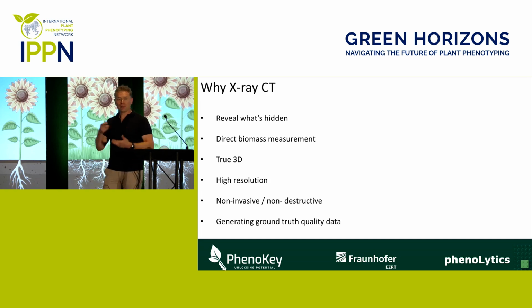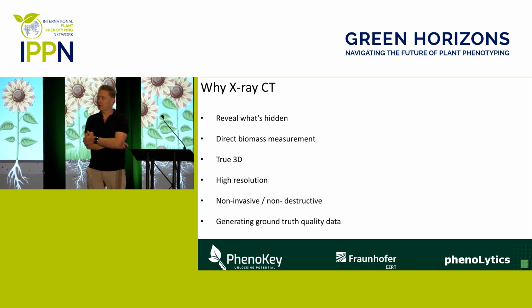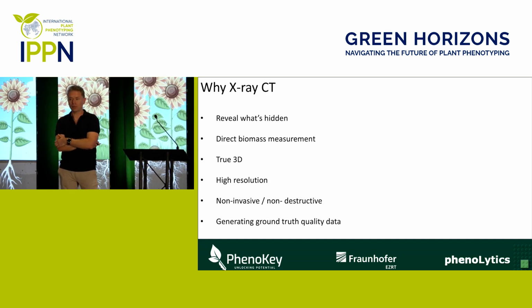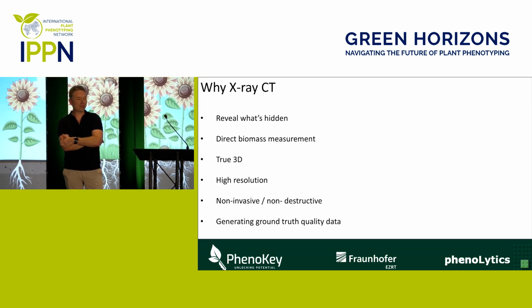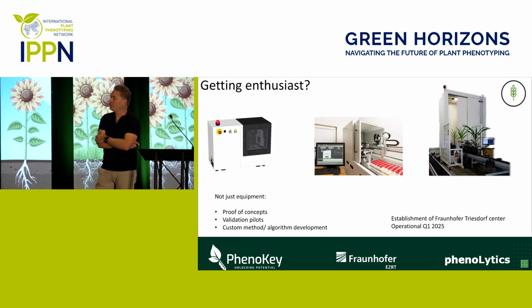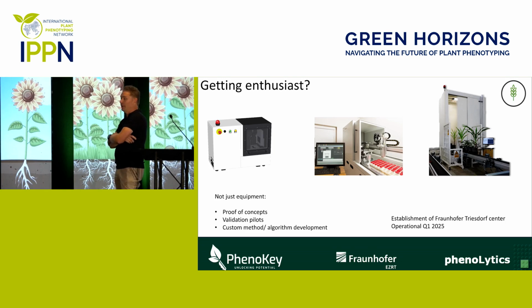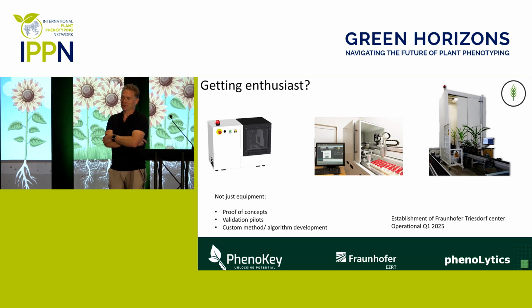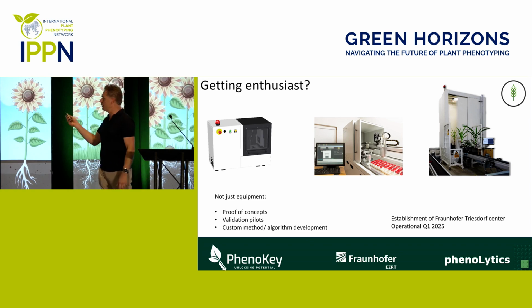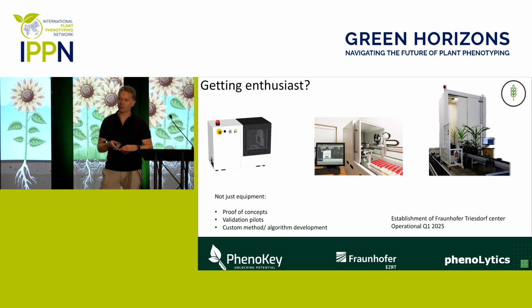So I hope that in the past minutes I could put these words to the test, and that it demonstrated that all that's stated here holds some merit. And if you are getting enthusiastic, which I can of course imagine, then there are different ways to proceed. Then you talk about hardware. There are different elements. You can think about tabletop solutions, intermediate solutions, and large-scale solutions, as you see on the right, which is an example from Purdue University.